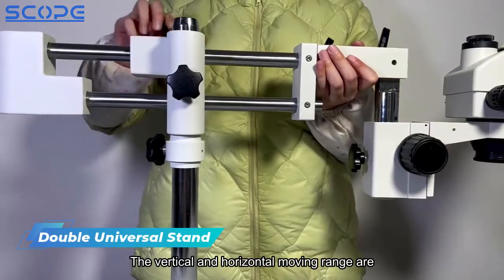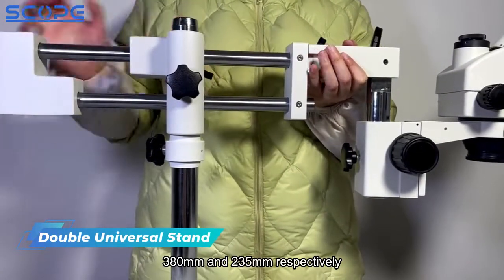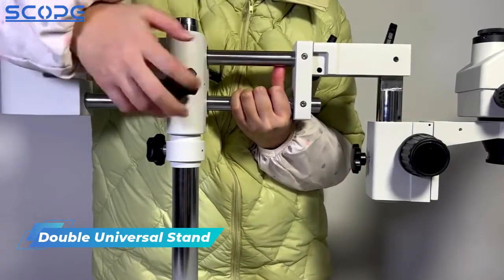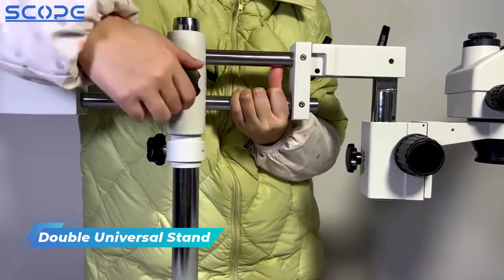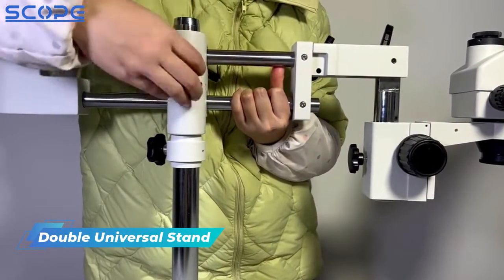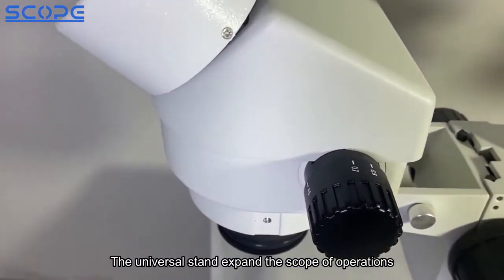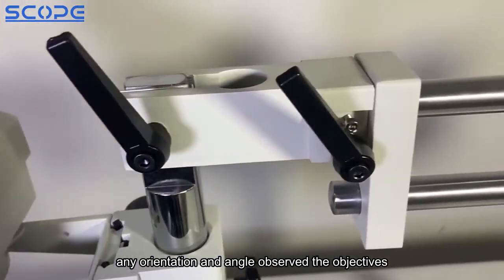The vertical and horizontal moving range are 380mm and 235mm respectively. The universal stand expands the scope of operations, allowing the objectives to be observed at any orientation and angle.